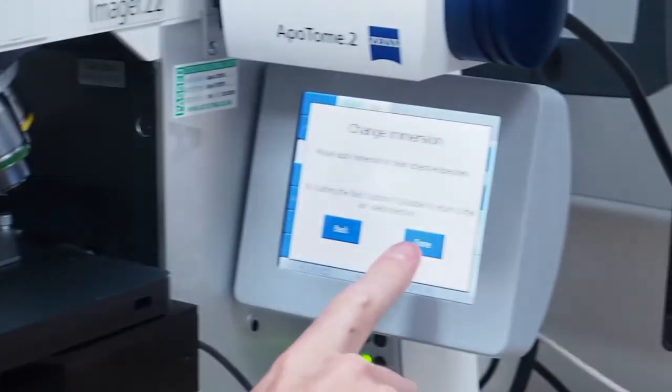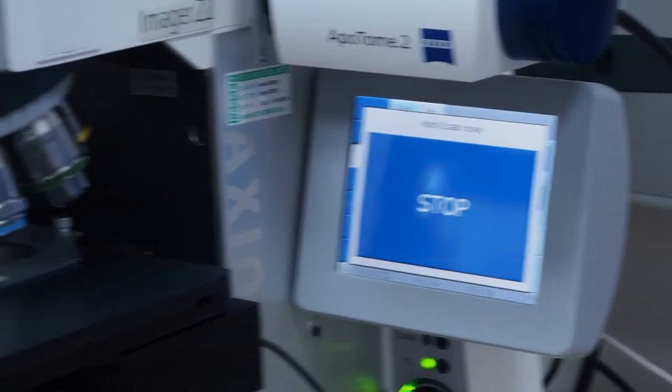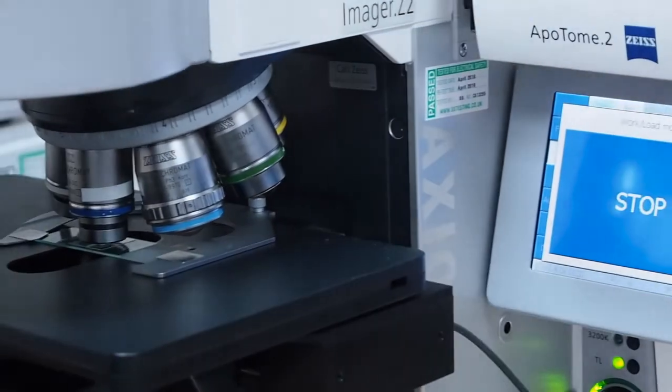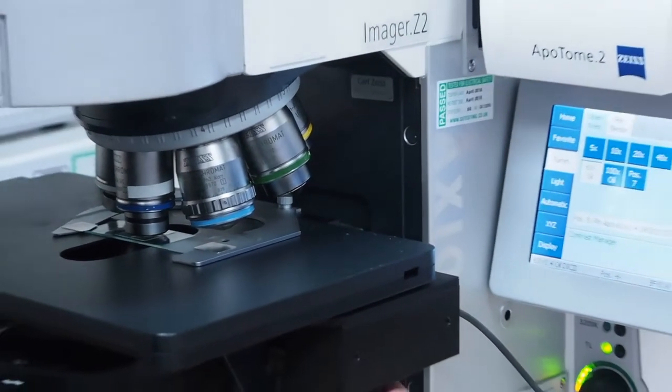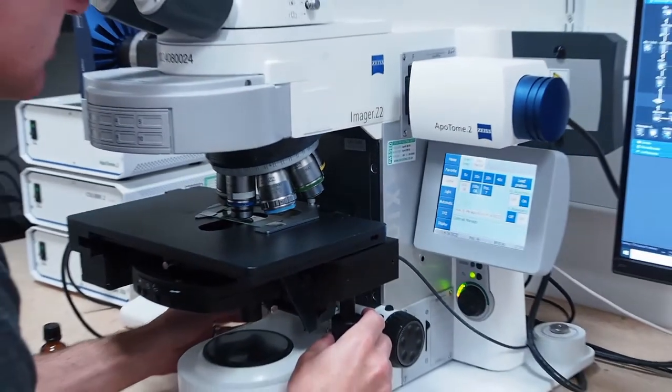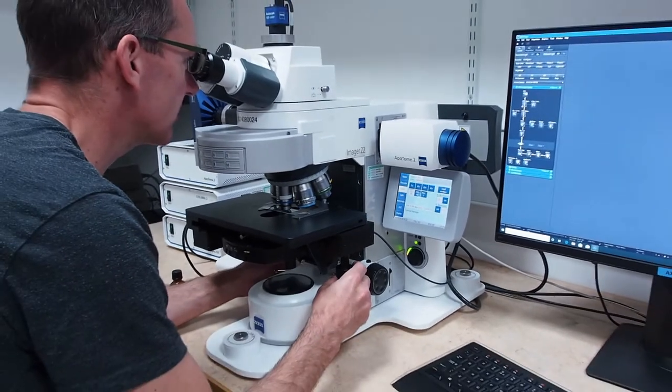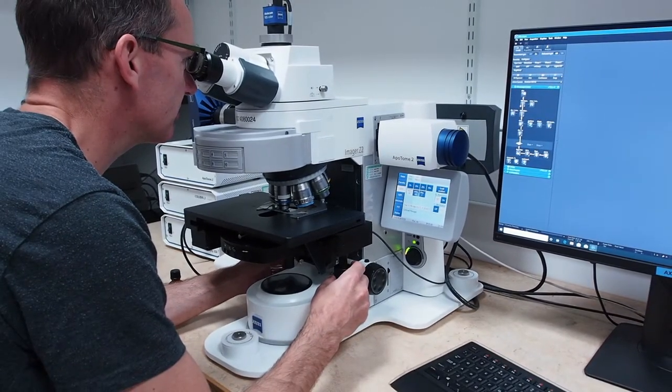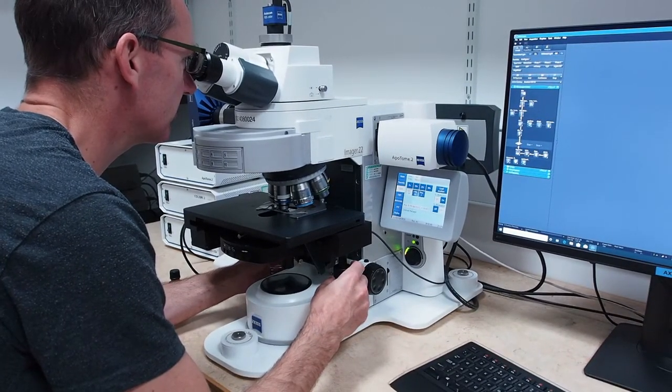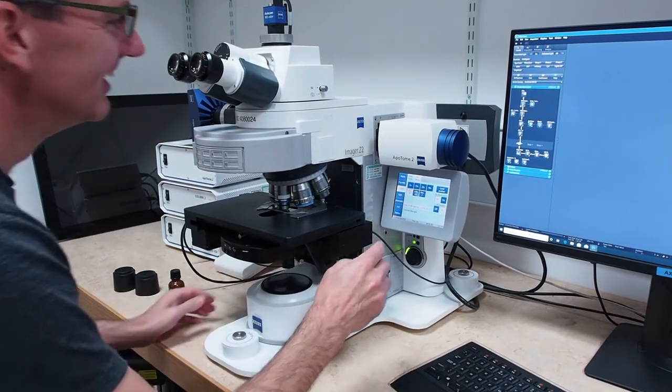Using the touch screen, click done and the stage will move the sample back to the same focal plane it was previously at. Using the oculus, fine tune the focal plane of your sample and then switch off the lamp used to protect your sample.